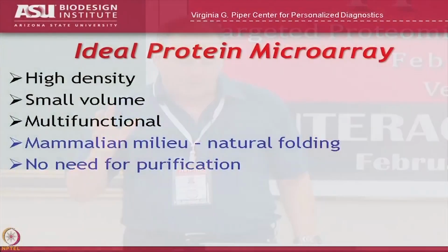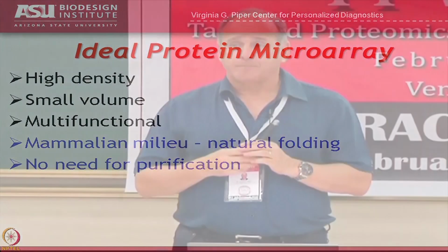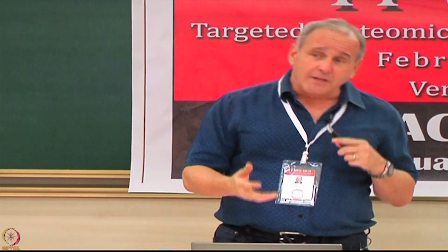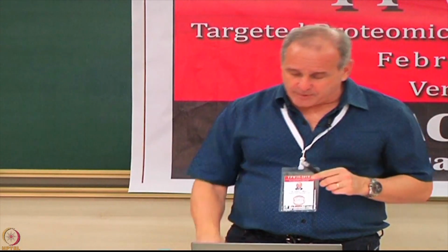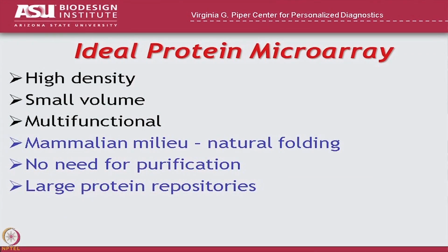You don't want to have to purify the proteins, because if you have to purify the proteins, then you're going to end up with all the things that can occur during protein purification. Proteins could lose their folding, they could get low yield, they may not be in the proper conformation. You obviously want to be able to test as many different repositories as possible, so you want to be able to test any proteins that you'd like.